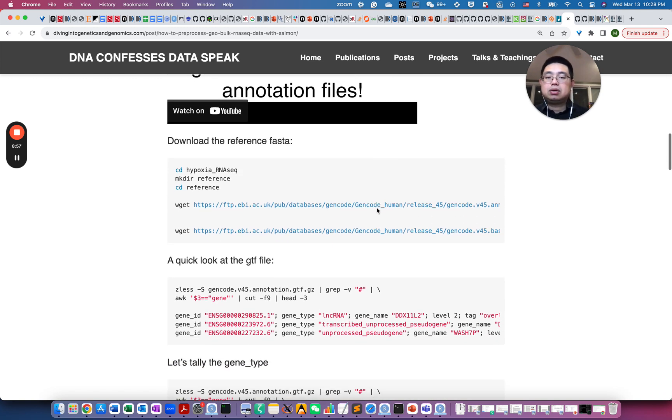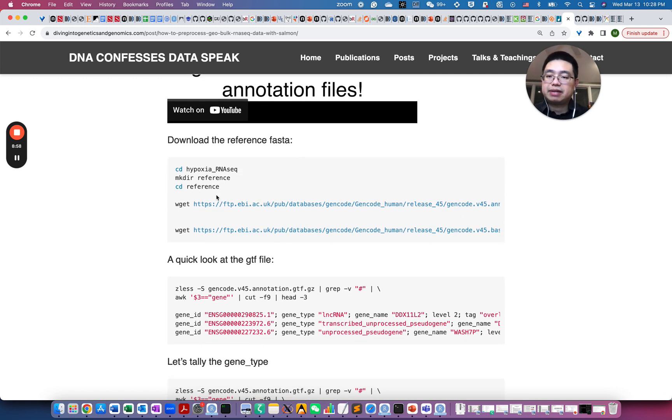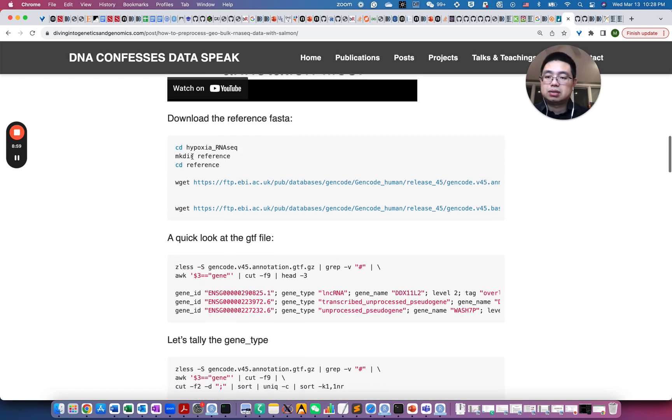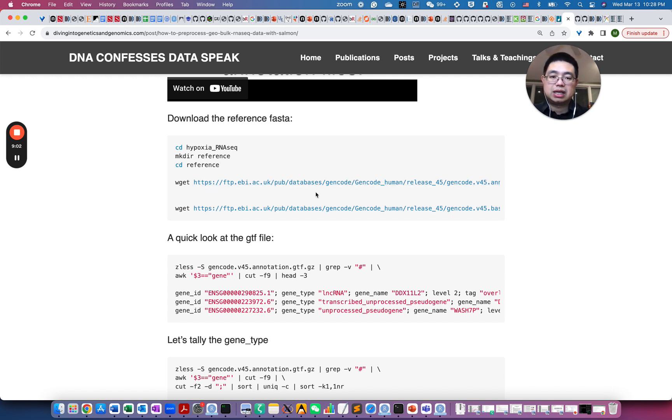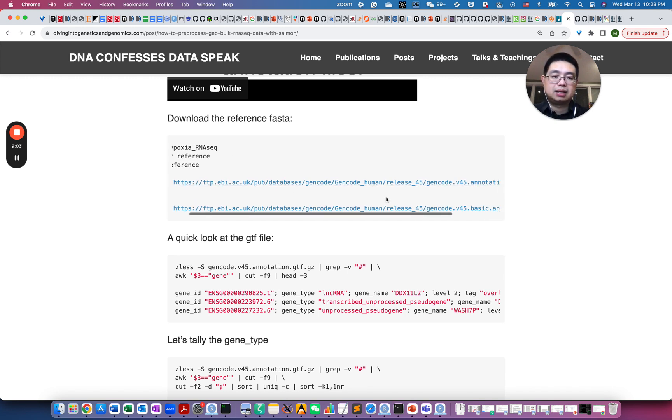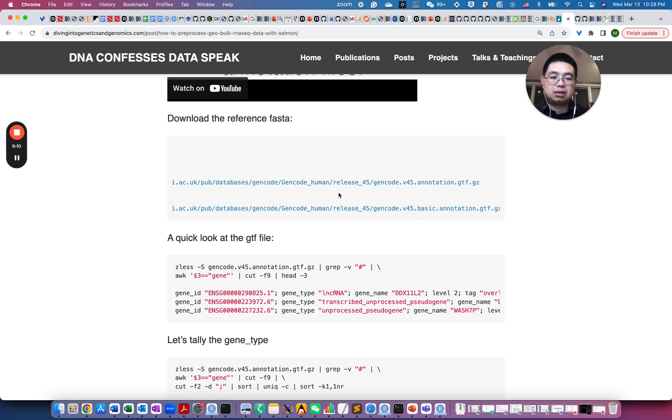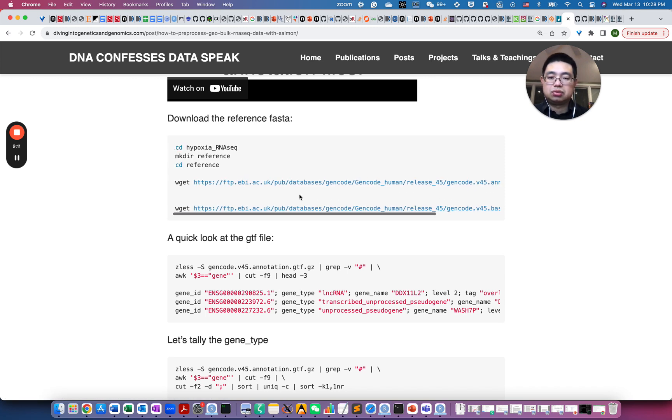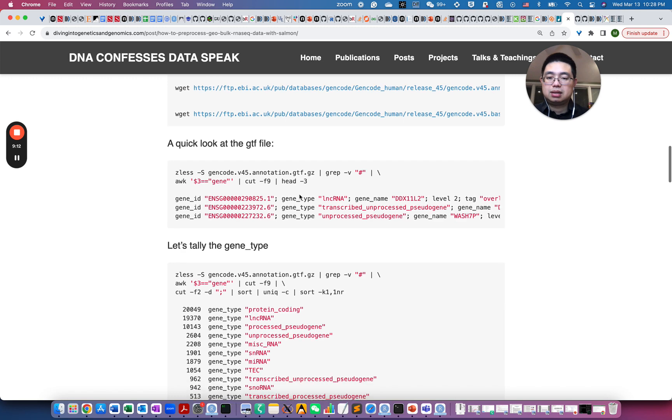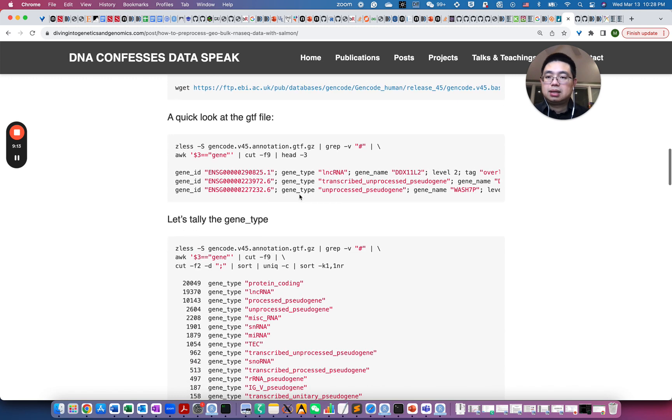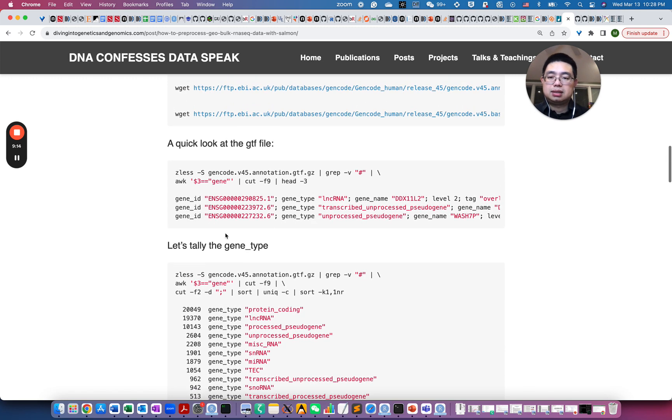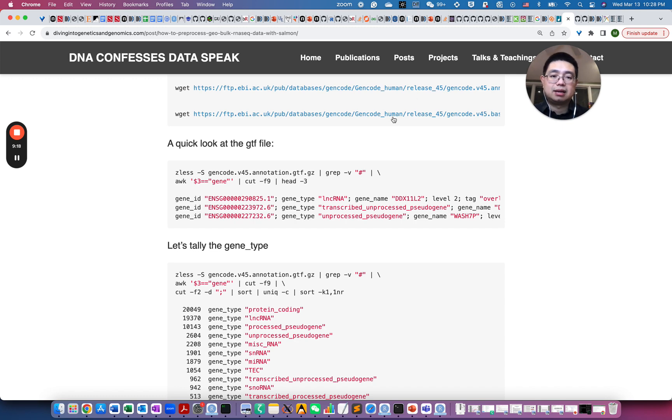So let's download the reference FASTA file. So we actually make a directory as a reference and we just use wget to get the annotation GTF file and those two GTF files, the other one is called basic annotation. So you can use either one.